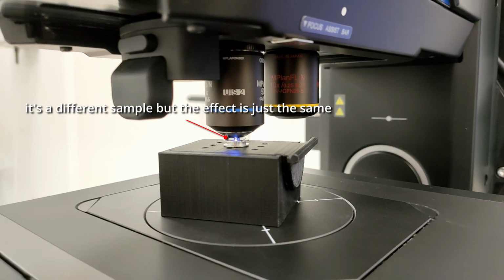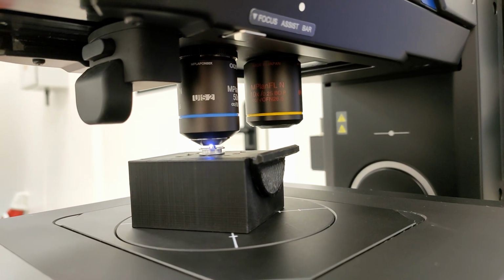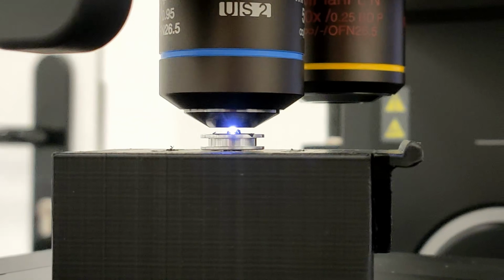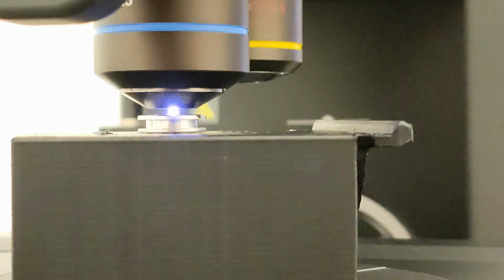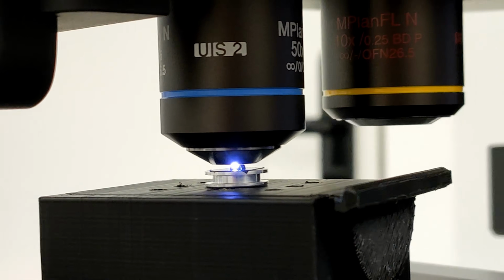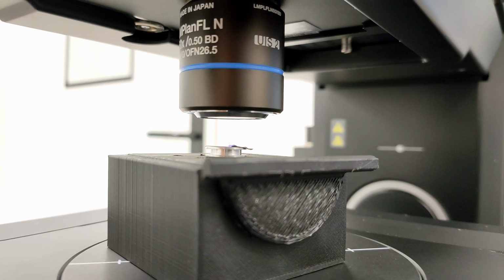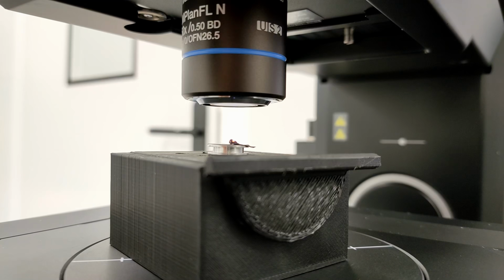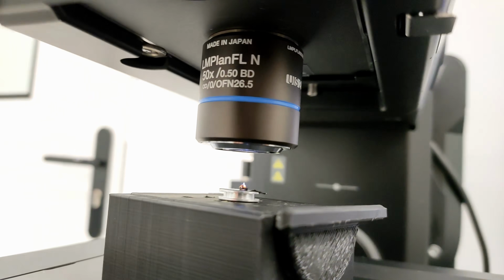In the case of the fly head, using a standard 50x objective is impossible. When I try to focus, I accidentally touch the fly's hairs, which causes the entire sample to move. This could even damage the objective. Instead, I use a special long working distance 50x objective, which allows observation of the fly's eye at about 700 times magnification. This is the final focus stacked image.